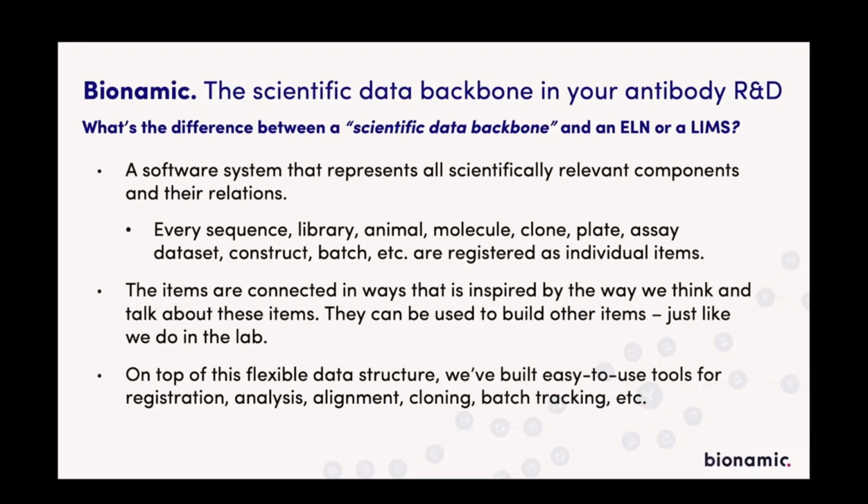in ways that make sense from a scientific point of view. So it's the same way that we talk and actually work with these things in the lab. We try to really map that to our data structure. So that's our flexible data model.